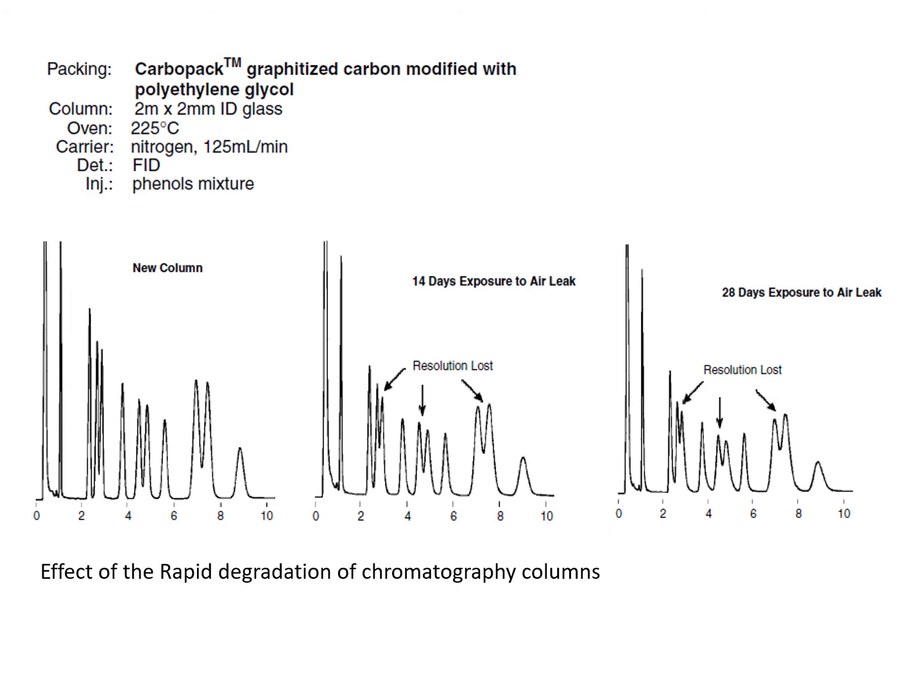The capillary column will degrade. Here we keep mentioning the degradation of the capillary column. That means something happens to the stationary phase.